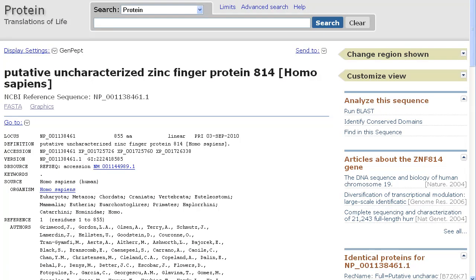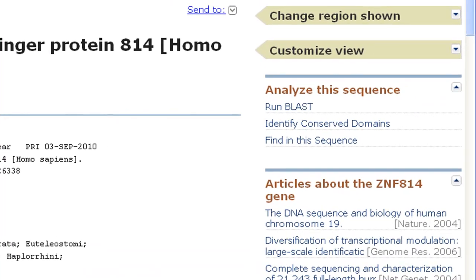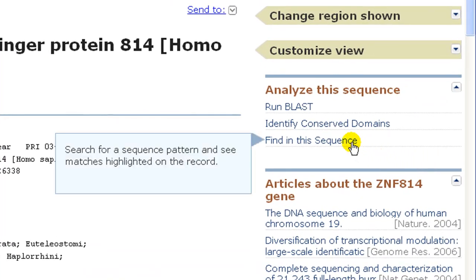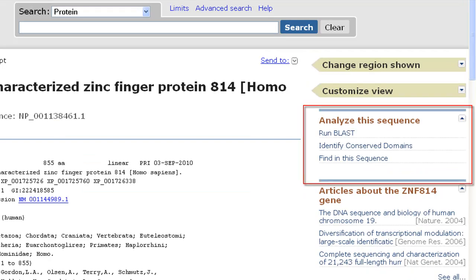This tutorial describes the function called findInThisSequence, which appears on records in the Entrez Nucleotide and Protein databases in the AnalyzeThisSequence section of the page.